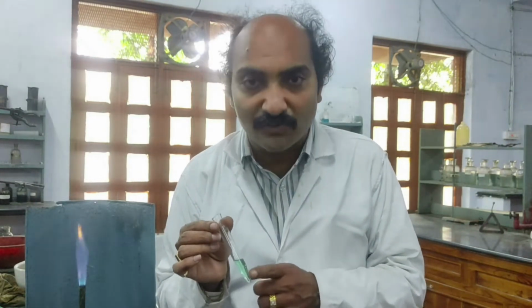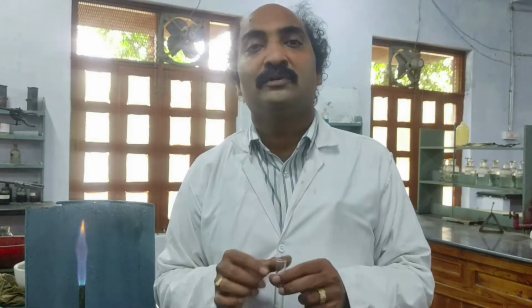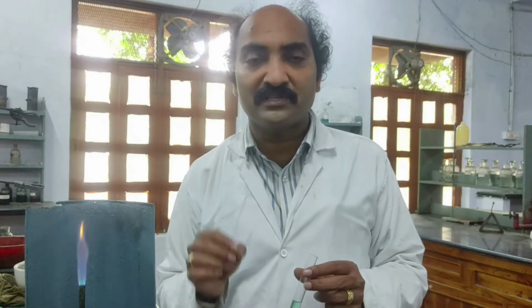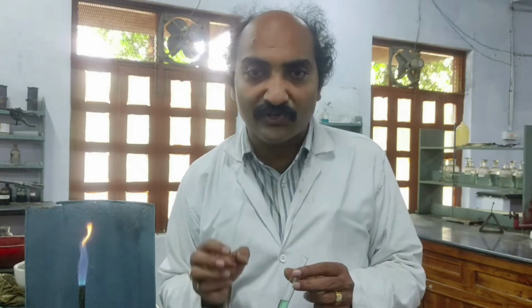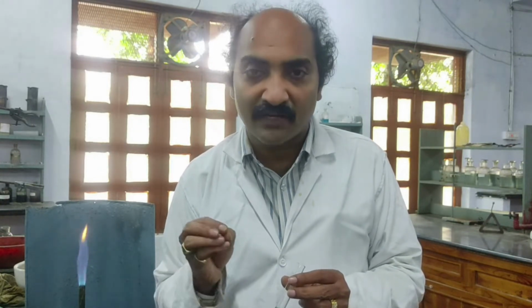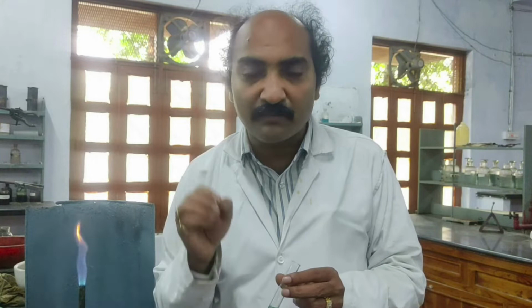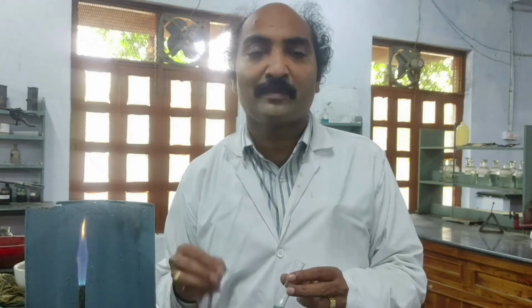For that, what should I do? I need to add fourth group reagent to this solution. If I get a precipitate, that implies fourth group cations are present. Now, what is fourth group reagent? Fourth group reagent is nothing but ammonium chloride solid in excess, ammonia solution. I told you already in the laboratory, ammonia is also represented as ammonium hydroxide. Now, to that particular solution, I need to pass H2S. So this is the fourth group reagent. So come again, what is fourth group reagent? Ammonium chloride solid in excess, ammonia solution, and then H2S gas.